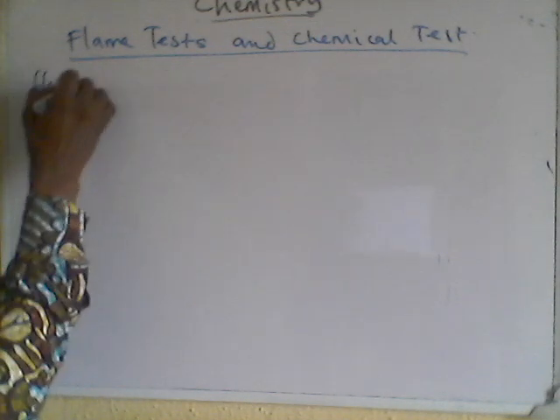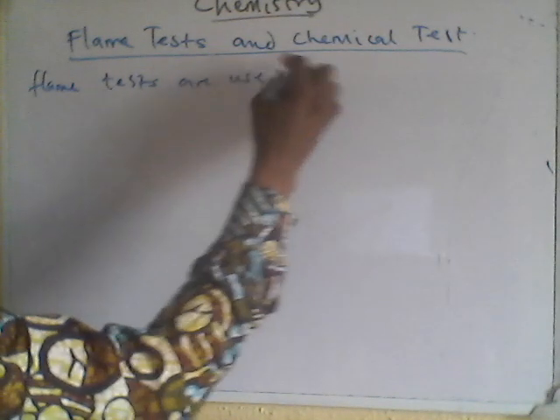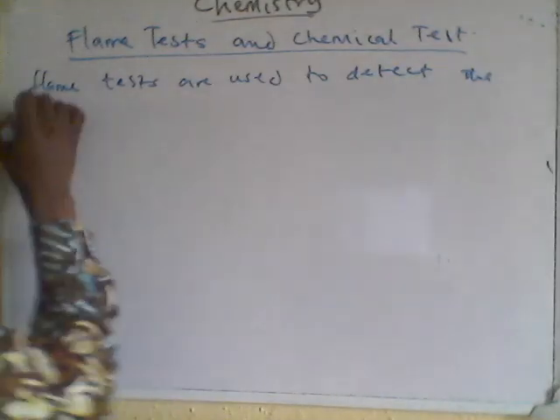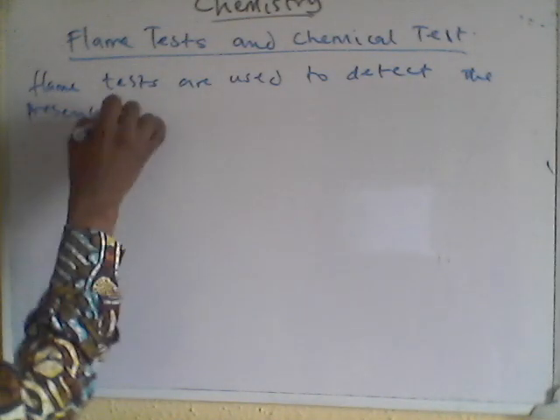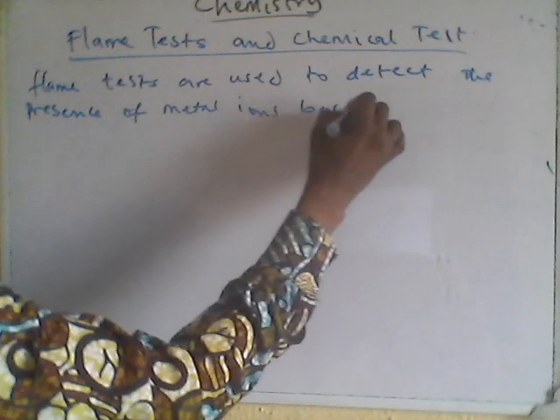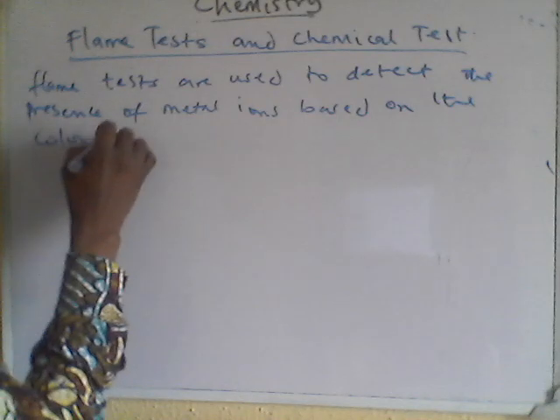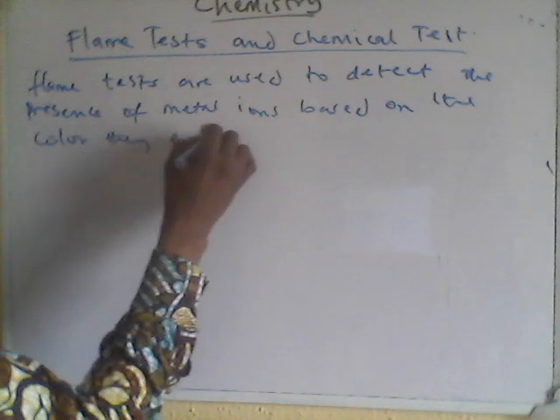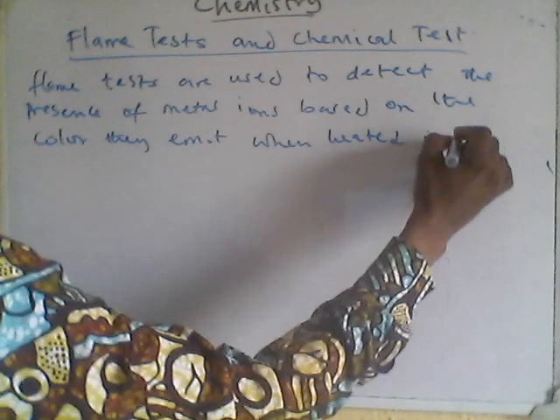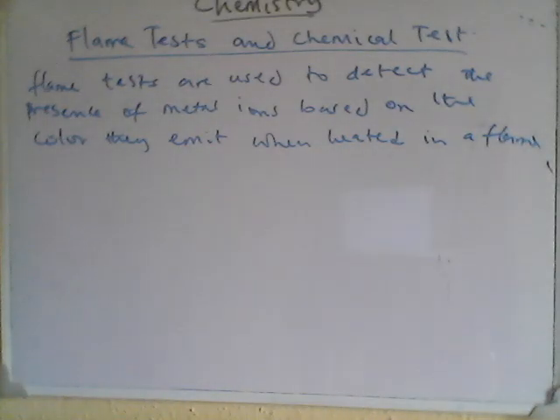So on the board: flame tests are used to detect the presence of metal ions based on the color they emit when heated in a flame.